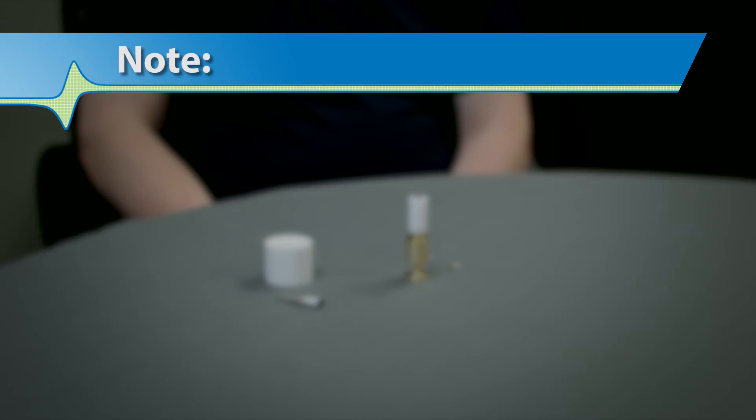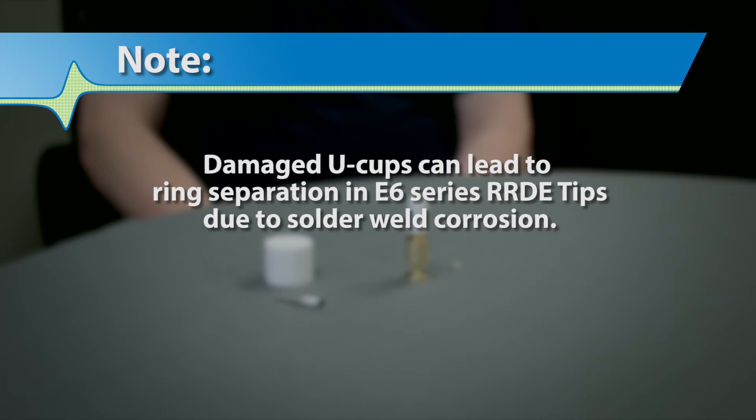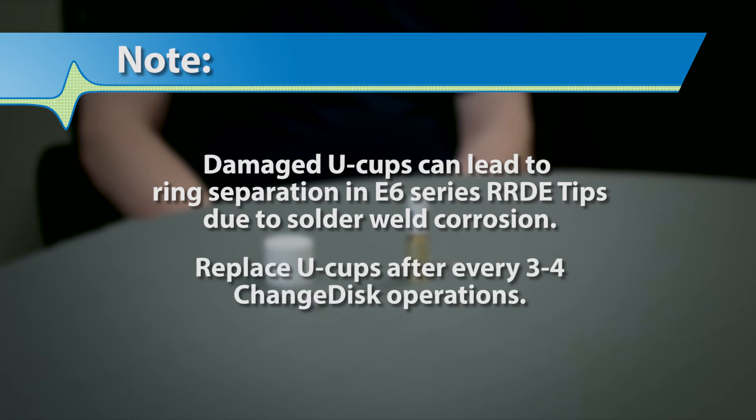A warning for you to consider. Damaged U-cups can lead to ring separation in E6 Series RRDE change disc tips due to solder weld corrosion. Replace U-cups after every 3-4 change disc operations.